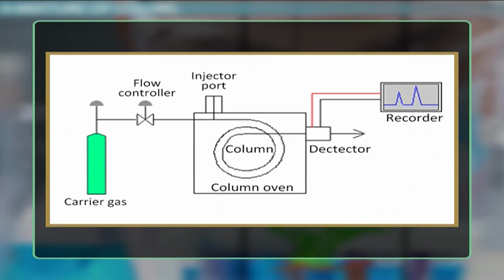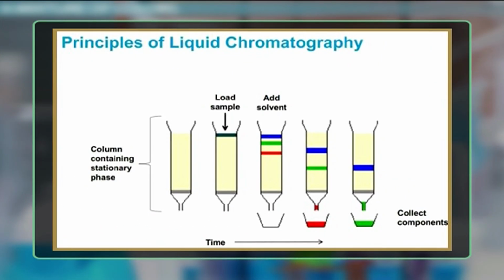History and development. Prior to HPLC, scientists used standard liquid chromatographic techniques. Liquid chromatographic systems were largely inefficient due to the flow rates of solvents being dependent on gravity. Separations took many hours and sometimes days to complete. Gas chromatography (GC) at the time was more powerful than liquid chromatography (LC). However, it was believed that gas phase separation and analysis of very polar high molecular weight biopolymers was impossible. GC was ineffective for many biochemists because of the thermal instability of the solutes. As a result, alternative methods were hypothesized, which would soon result in the development of HPLC.